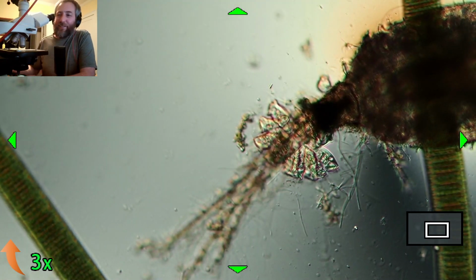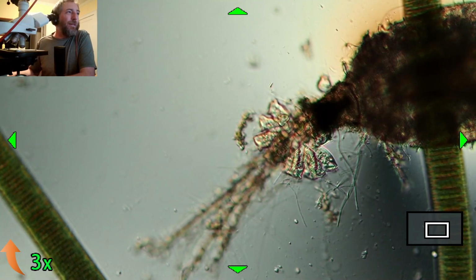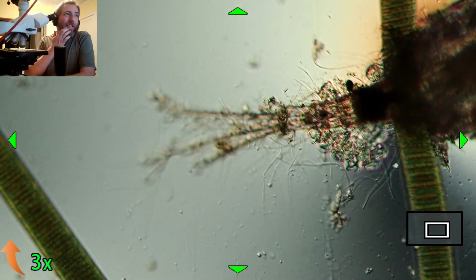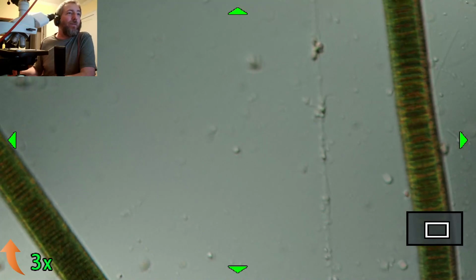Yeah, this thing you just buy once and then don't screw up, keep it clean with chem wipes, basically. And you can have this thing basically run forever just with changing the light bulb.